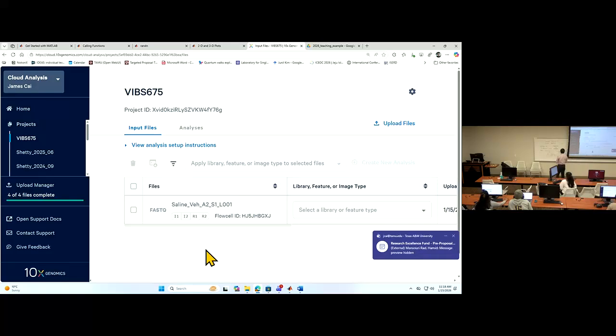You should know in a Windows system what the file extension is. We need a GZ extension, but that extension may be hidden, so you don't see it. We need to know whether a file ends with txt or something else, or MD. So we need information about this extension. The file you download will end with GZ, which is a zipped file. If you click into it, you see FastQ in there. You cannot upload things inside the GZ. You need to upload the whole zipped file. So that's the problem you had.